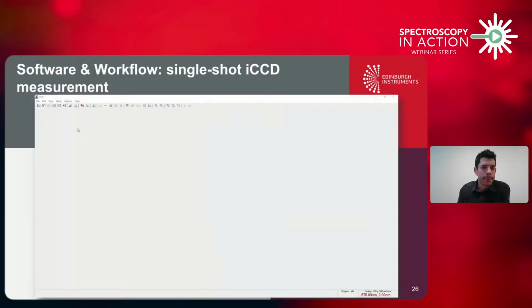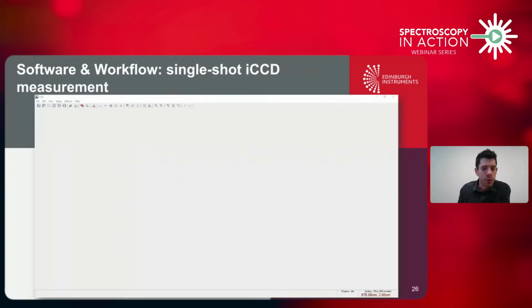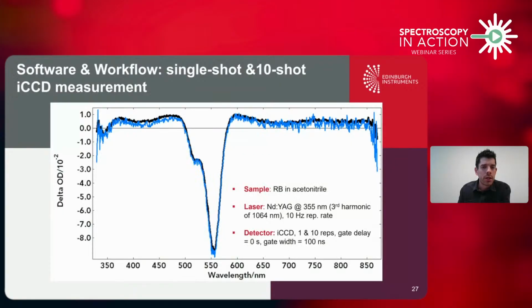Okay, I'm going to move to the next slide. So this is the result if I wanted to compare the single shot measurement with the 10 shot laser measurements.